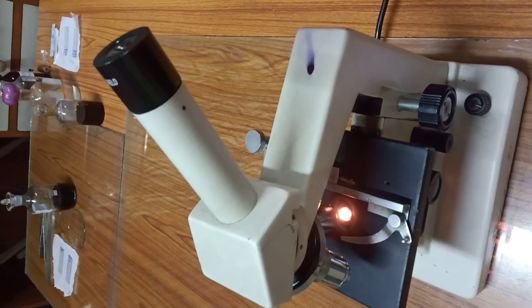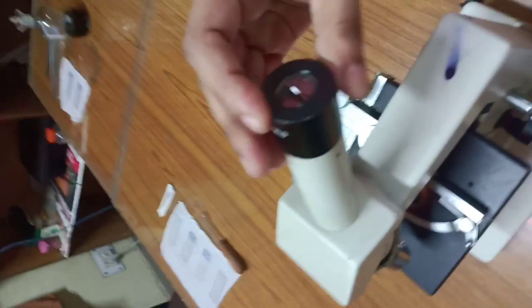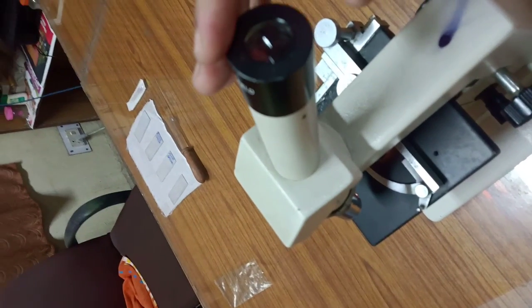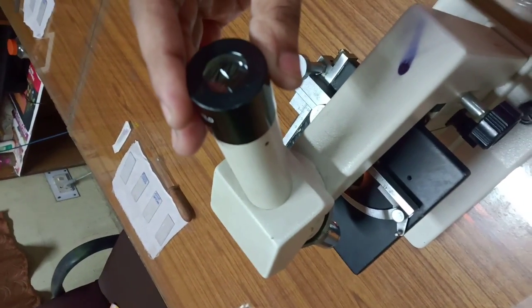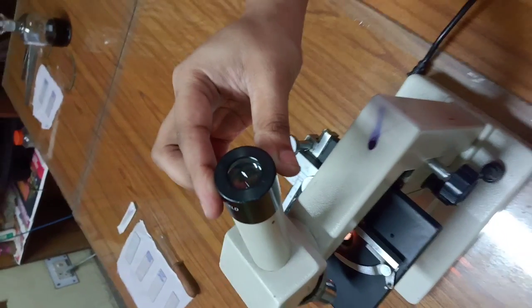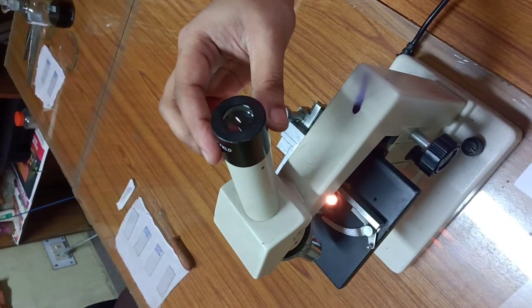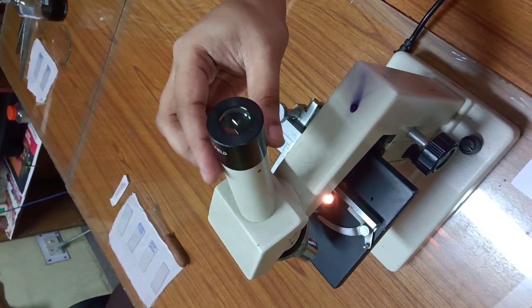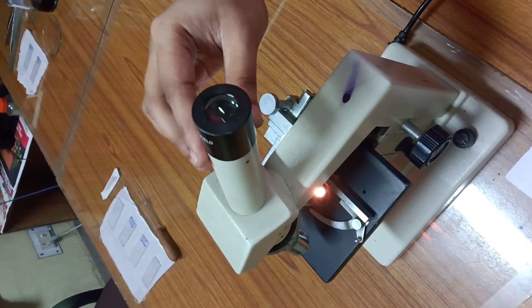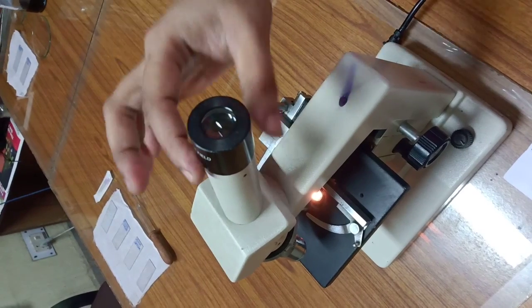Okay, so let us see the parts of a microscope. Here you see the eyepiece. Number 1, you see the eyepiece. Now this is the eyepiece, also known as the ocular lens. The eyepiece or ocular lens is a cylinder containing 2 or more lenses. Its function is to bring the image into focus for the eye. The eyepiece is inserted into the top end of the body tube.